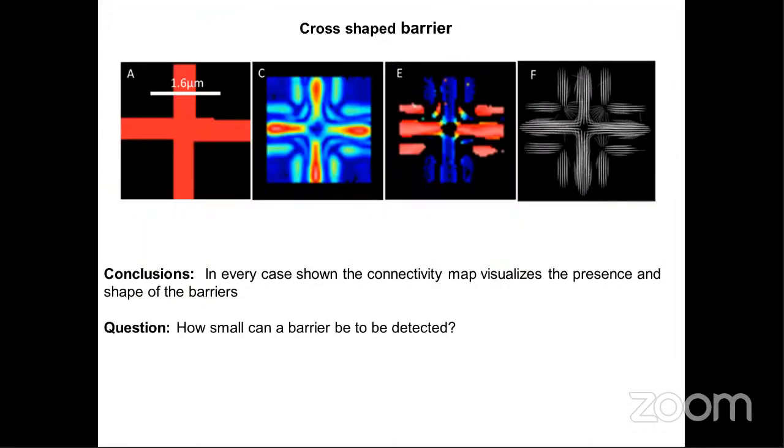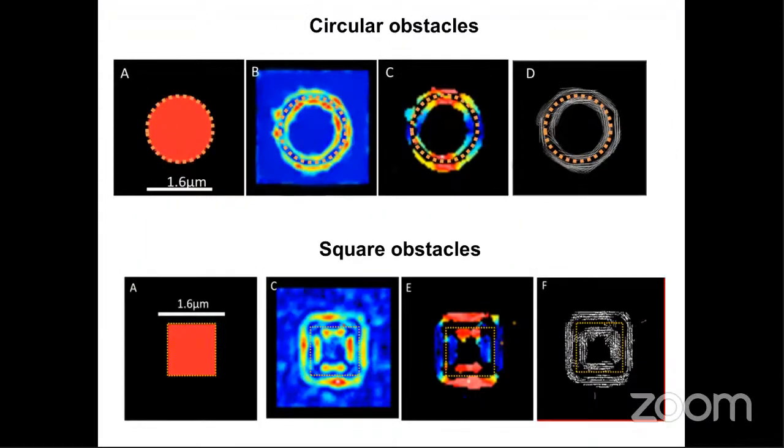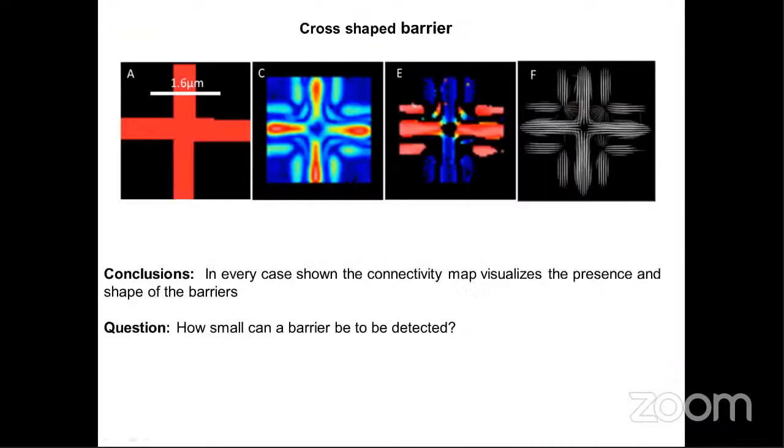There is a question here in the chat. I can read it for you. Yes. It's in Spanish, and I will translate both ways. The question is how I can characterize the noise with the pair correlation function, and if there are any maximum value in the correlation that we can do or not.